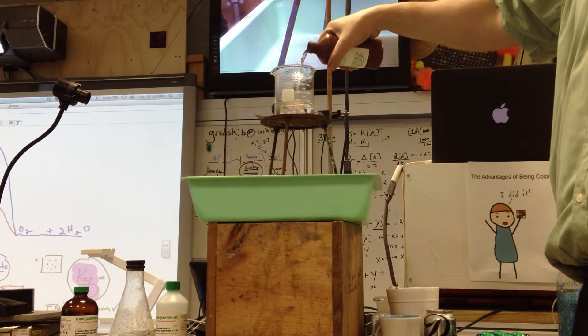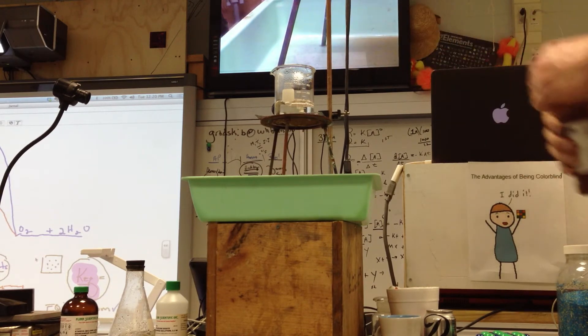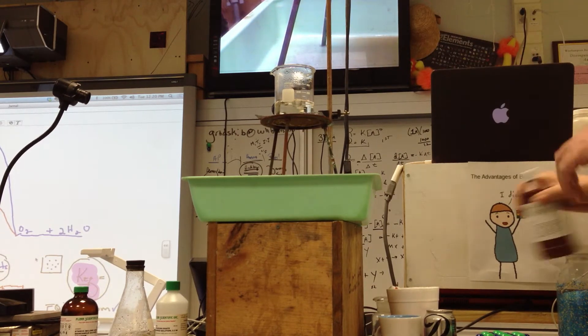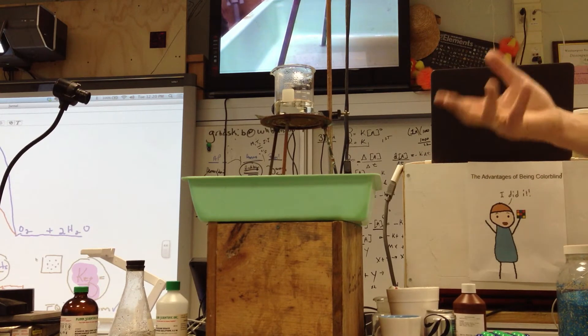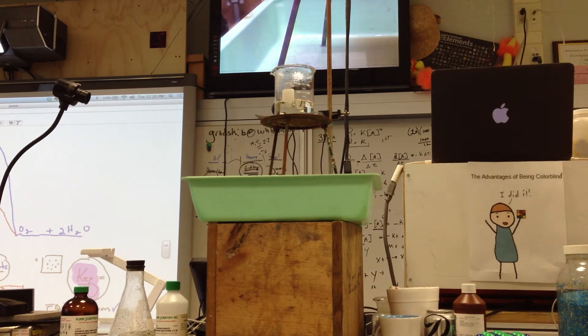This is 30%. Okay, so that's not good enough. Now, nothing's going to go on, or if it's going, it's not going to be that sexy because the rate of reaction is too slow.